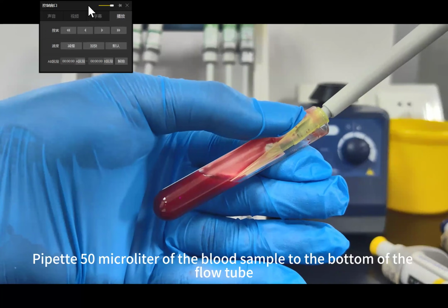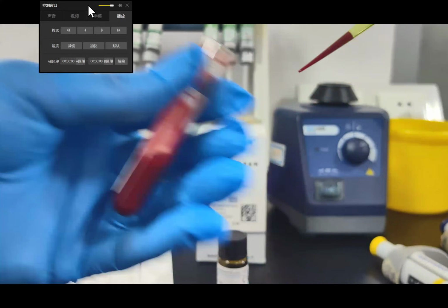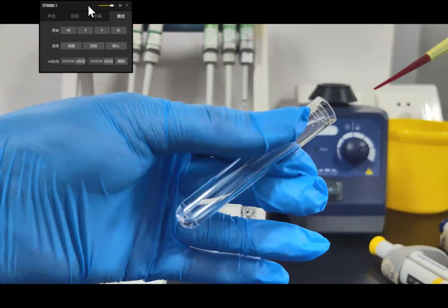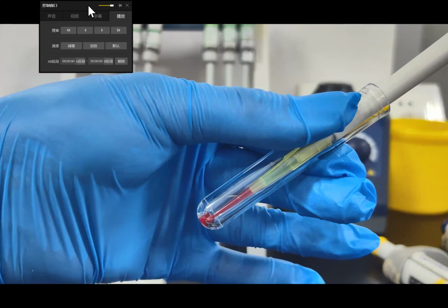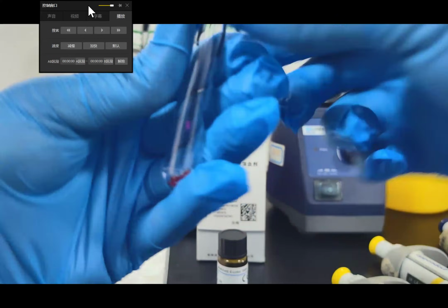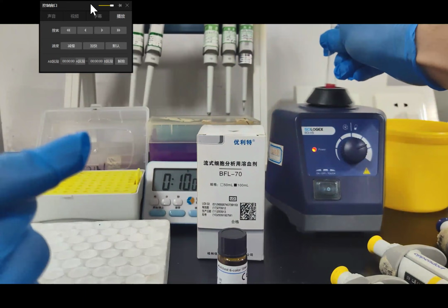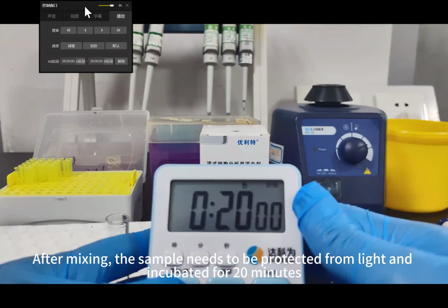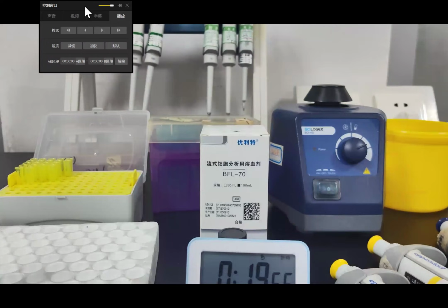Pipette 50 microliter of the blood sample to the bottom of the flow tube. Vortex the flow tube to mix the antibody with the blood sample. After mixing, the sample needs to be protected from light and incubated for 20 minutes.